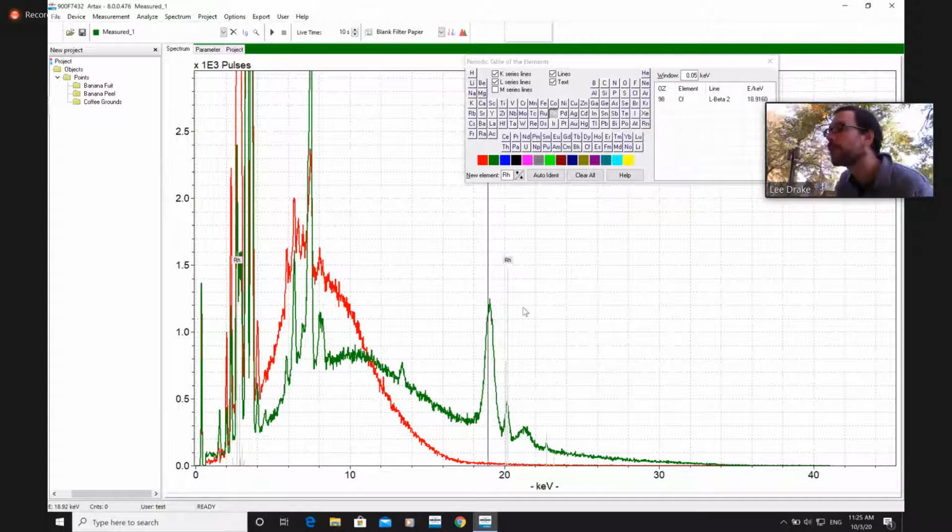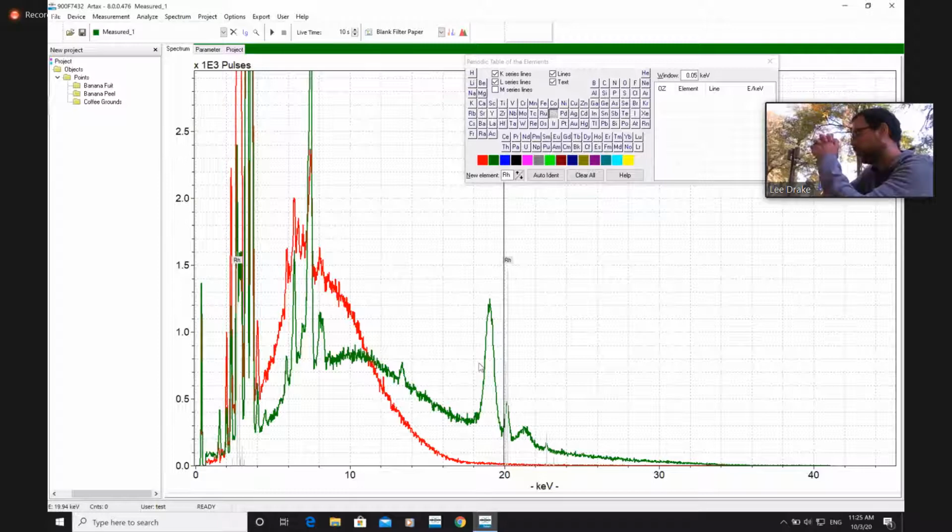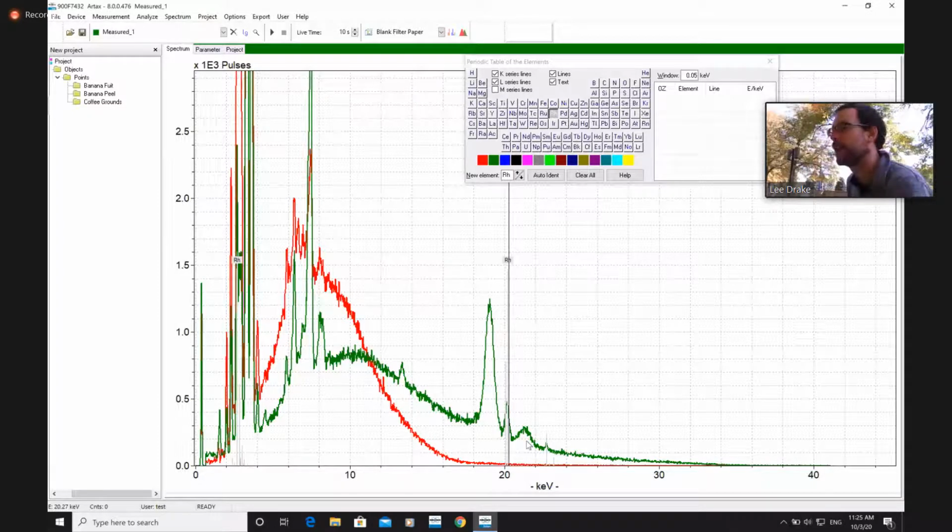By the way, if you were ever building a quantitative calibration with XRF, some people like to use the Compton peak to do their normalization to. This is a bad idea because Compton is very responsive to light elements that are present in the sample. The more carbon and oxygen, the more your Compton goes up. So if you're calibrating to rocks that happen to have carbonates, you're just going to have some trouble. The really good thing to normalize to is the Rayleigh peak, the rhodium, the elastic scatter. It's a little more neutral to the effects of density, and so your calibrations will be less influenced by surprise unknowns. But in any case, those are those three peaks.